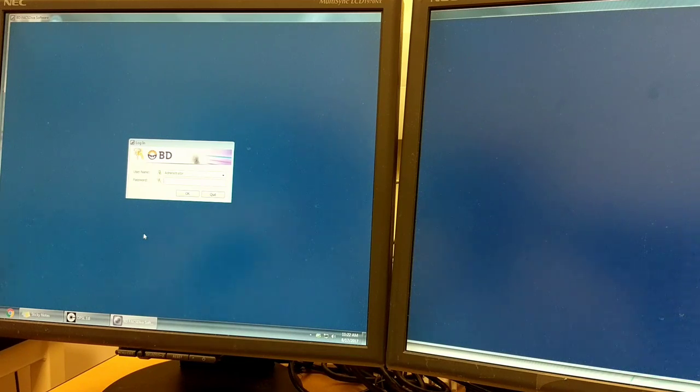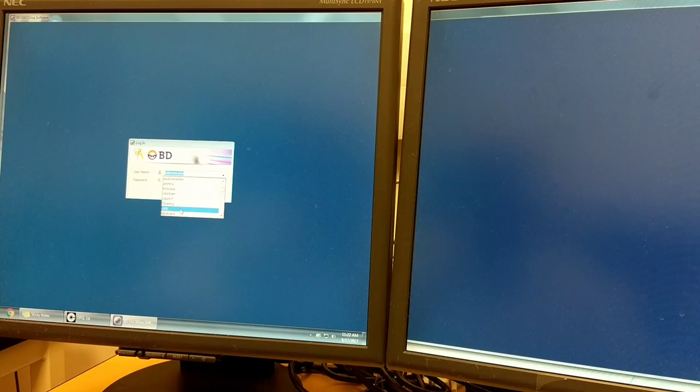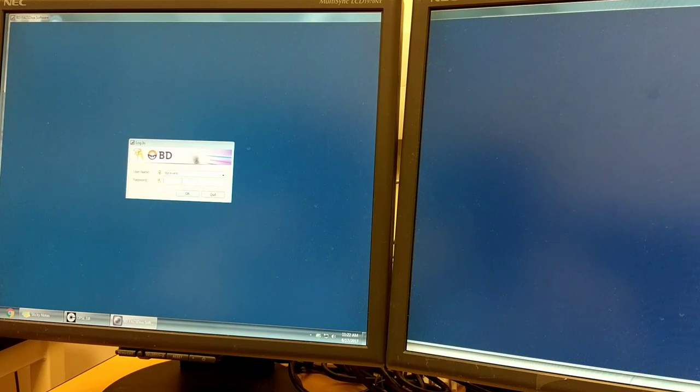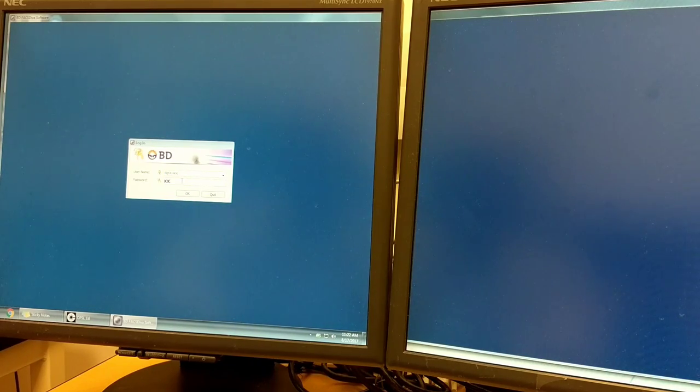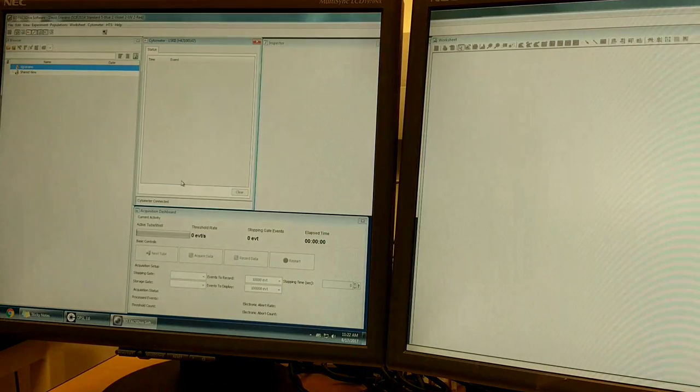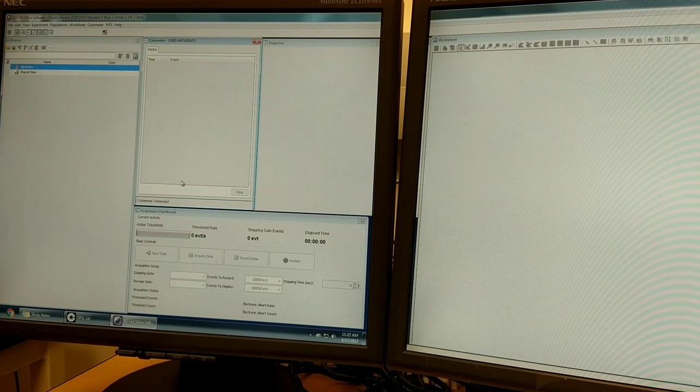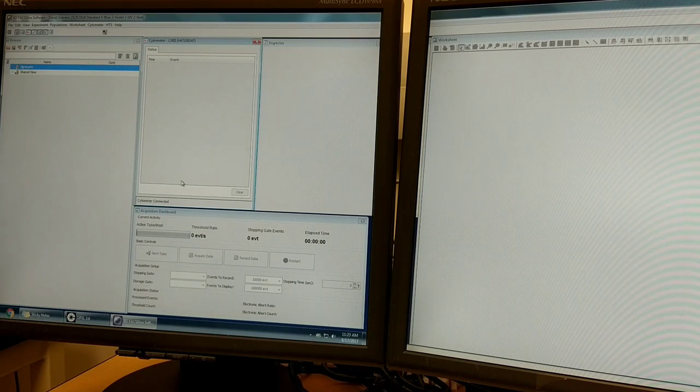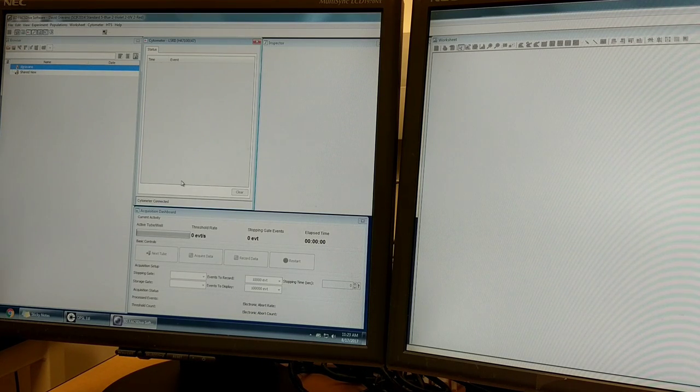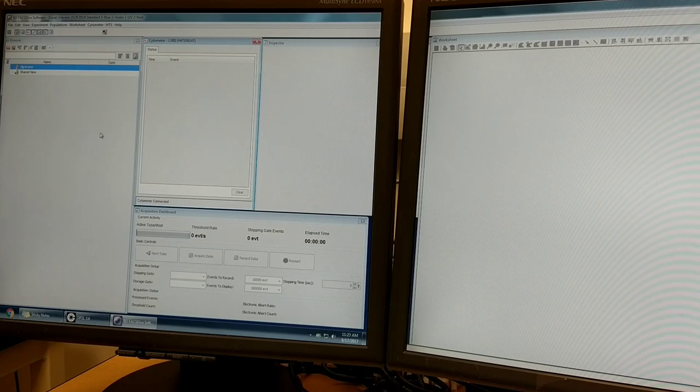The first step is to log in. Each user at UC Merced has a unique username for the Diva software. Once you're in Diva, there are several windows that all have different functions.